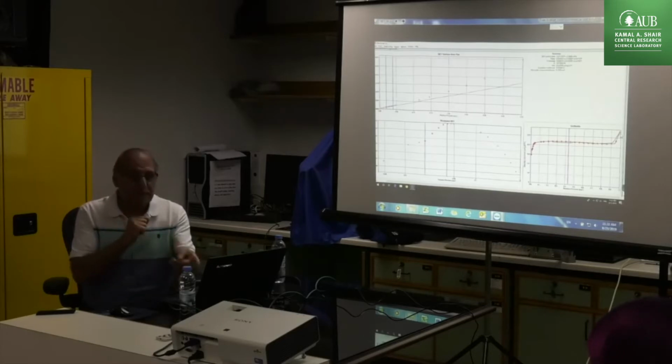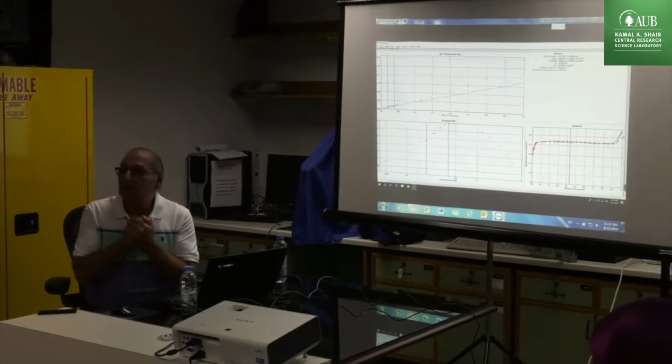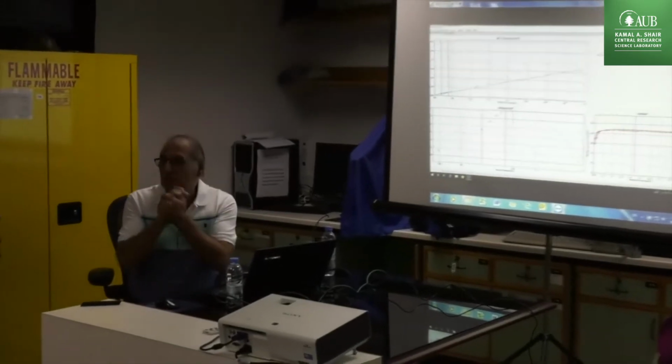If it is interparticle volume, when I compress it, it's going to disappear or get much smaller. If it gets smaller, this is the distance between particles, so it's not pores, and I can avoid it. But if it's really large pores, I cannot compact it, because I'm compacting only a little bit, so I don't change the macroporosity. It's still the same. This is the only way I can tell whether it is large pores or interparticle pores.